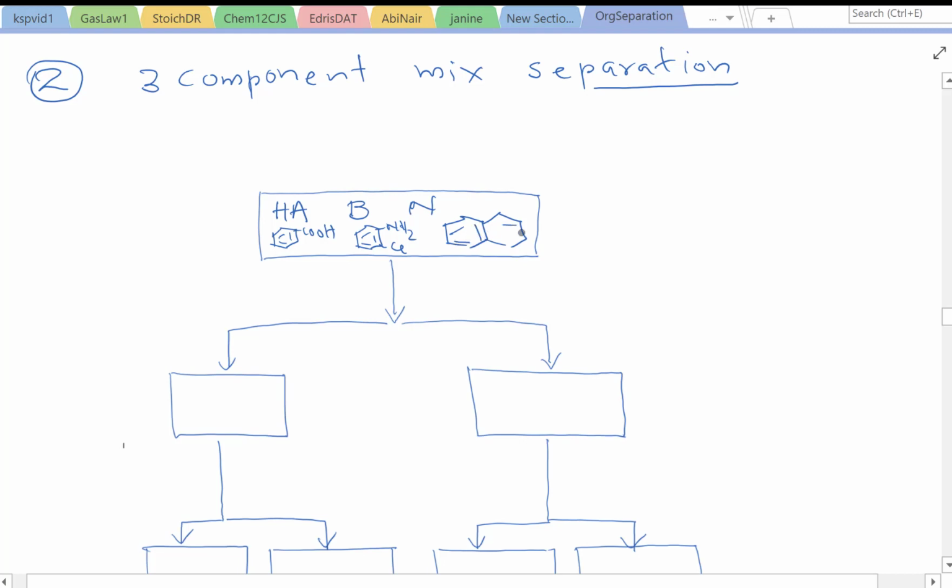It's carcinogenic, so normally, if available, toluene would be a better choice than naphthalene, right? Naphthalene is the mothball, so we don't use them anymore. Ask your grandma, they know about mothballs, right? Okay. So this could be in 50 milliliters of DCM, or I would say DEE, diethyl ether. So D or DCM, and that actually makes four components, but we should call it a three component mixture. Now we have everything cleared.